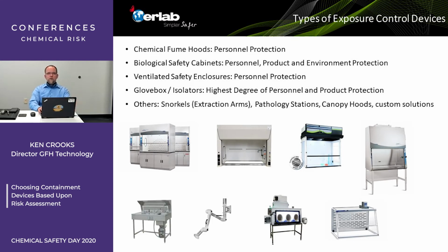Whether they're snorkels, extraction arms, elephant trunks, call them what you will, pathology workstation is in the lower left corner there, canopy hoods, similar to the hood over the range in your kitchen or my kitchen, just drawing some air and hoping to remove a nuisance odor. In many cases, these do not provide the level of protection of a biosafety cabinet or a chemical fume hood, so you really have to make sure they're the right product for that application, and I'll talk a little bit more about that later on.